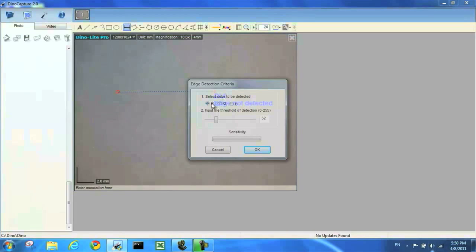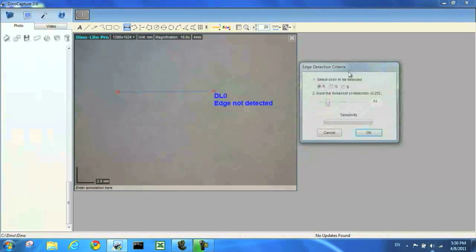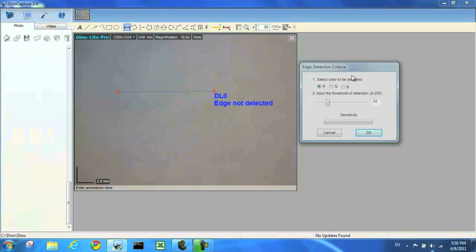In this window here I have several options about color and detection threshold. I'm going to leave color at default and throw one of my samples under the line to test the detection.